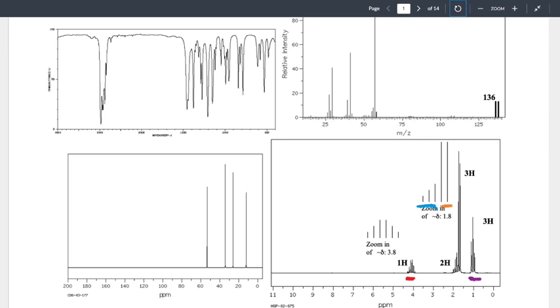And we will encounter a case where that question mark becomes fully resolved within HNMR. Sometimes it won't fully resolve and we have to use the chemical formula. How about the bottom one? I've got 3 hydrogens. What should that interpret to?